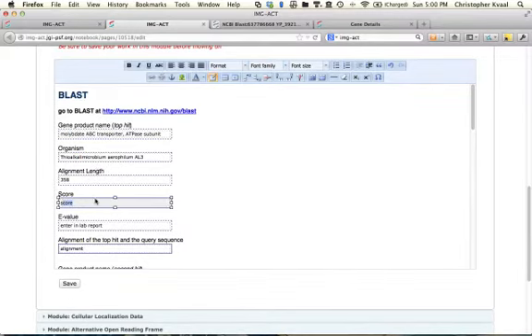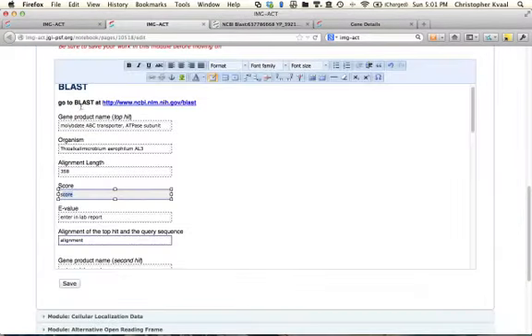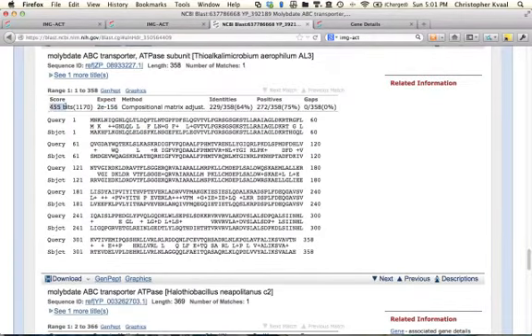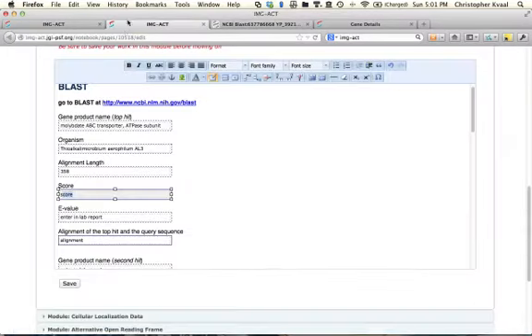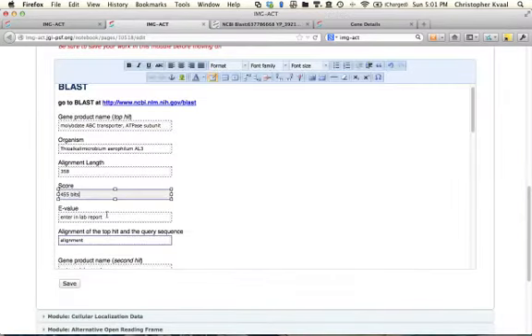So now we have the two parts of BLAST that really are the learning objectives and the learning outcomes associated with understanding sequence-based similarity searching. And that would be right here, something called a score, measured in bits, and something called an expect value. So as I'm copying and pasting these into my lab notebook, I'm going to discuss the role of the score and the e-value in your interpretations. We'll go over here and grab the score of 455 bits. And we'll pop that score right in here. And then grab the e-value, and we'll copy the e-value and paste it right in here.